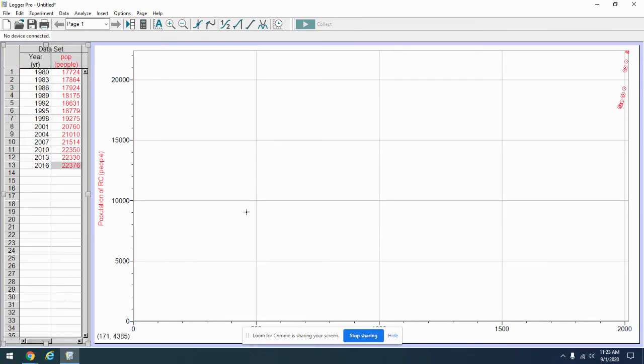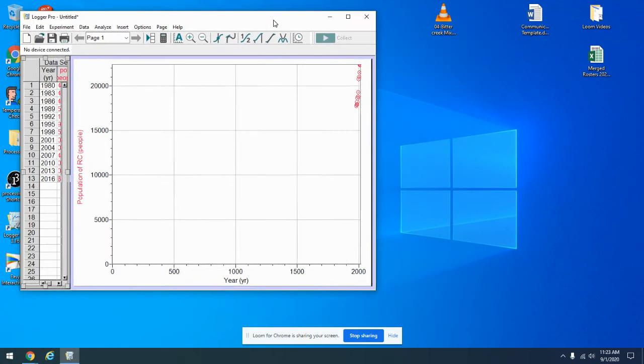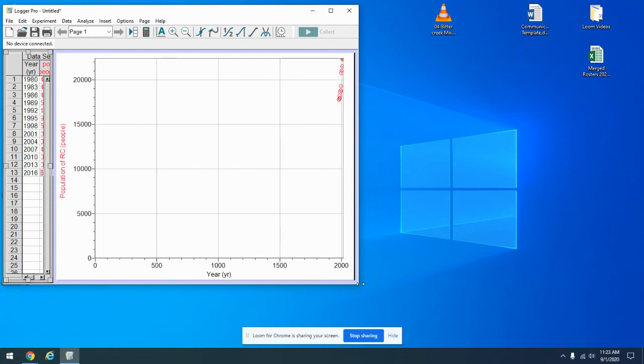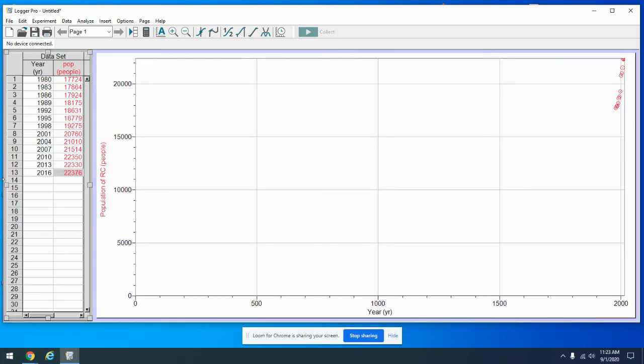Yep, that looks good. Okay, so now let's look at the graph here. A couple things to note. I'm not sure if you can see that little window at the bottom, but let me just fix this so that that's not in the way, just in case it was. All right, that's better. Okay, so notice here, it looks like nothing much happened.